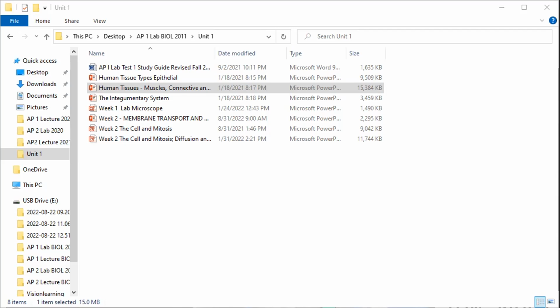Now these little purple things here are called glial cells. They are the helper cells for the neuron. They circulate cerebrospinal fluid. They fight infection. They provide nutrients for the neuron. They insulate the neuron's axon so that it can send nerve impulses at a faster rate. And there are many more glial cells than there are neurons, because they're all busy working in the central nervous system to help all these cells.